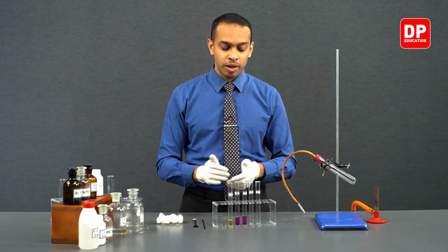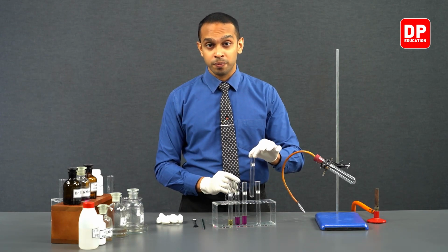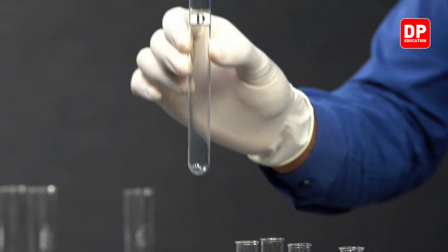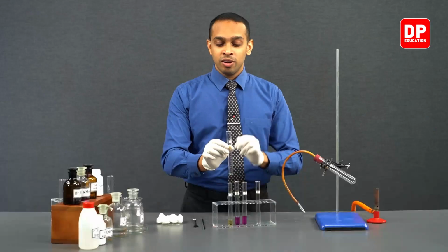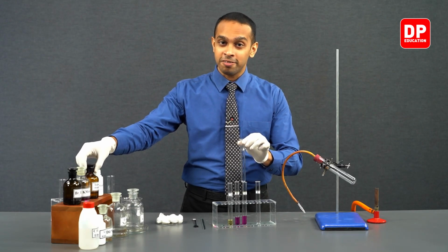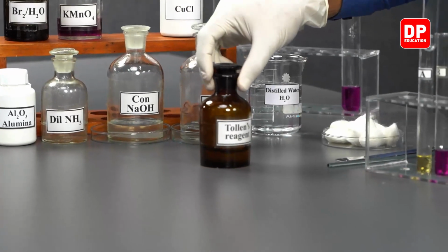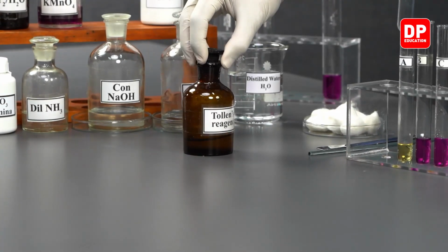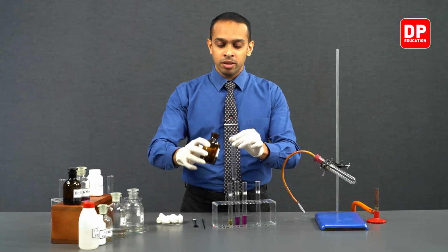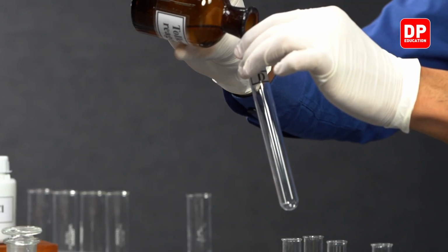Afterwards, we have to move on to our test tube D, which should contain ammoniacal silver nitrate, in other words, Tollens reagent. We have a prepared Tollens reagent here. So we can take our Tollens reagent and add a small volume into our test tube here.